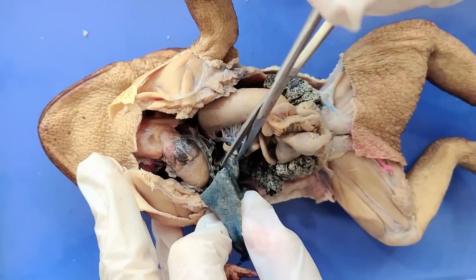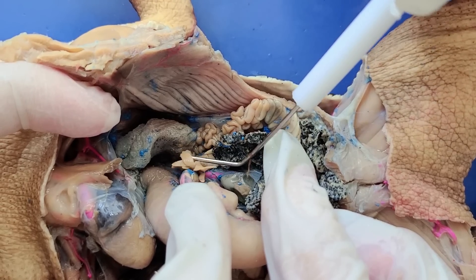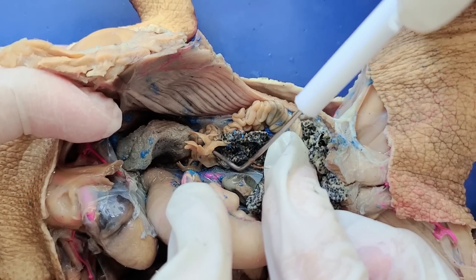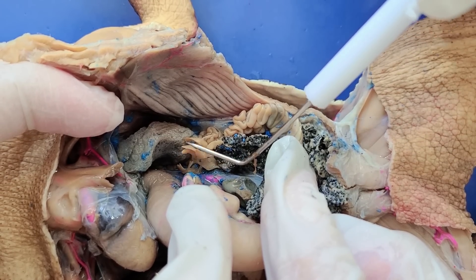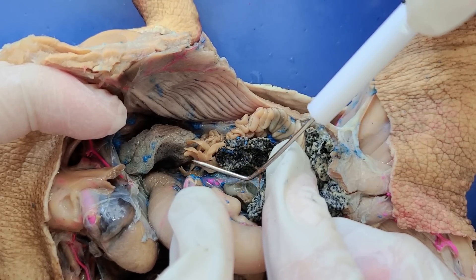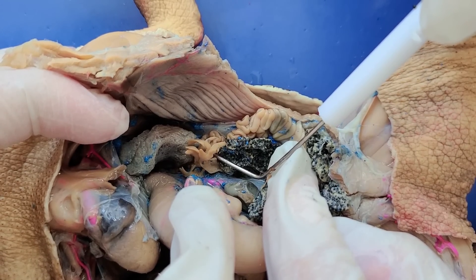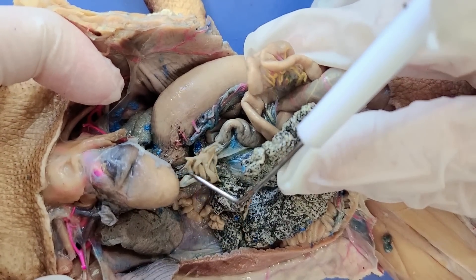Now I'll cut out the liver to see the structures underneath it better. On the side you can see these yellow finger-like projections — these are the fat bodies of the toad, which is where fat is stored. The fat bodies allow toads to store more fat and hold on to extra energy reserves. This is especially important when the toad is preparing for hibernation, a state of minimal activity that toads often enter in winter. You can also see another set of fat bodies on the other side of the toad.